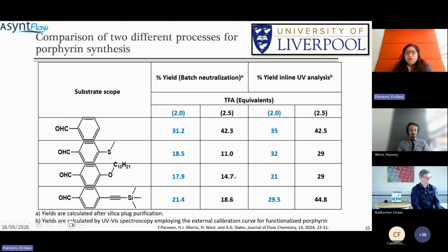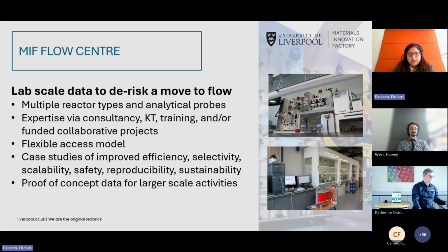So to further improve this process, we suggest we should add an inline purification method so that we can further improve the process of the system, and further, collecting the data at multiple points in the reactor would be essential if we want to fully understand the process. That will be covered by my colleague Harvey in his slides.